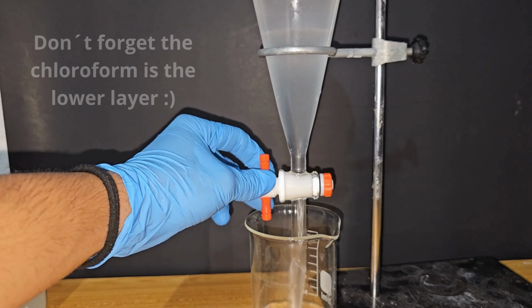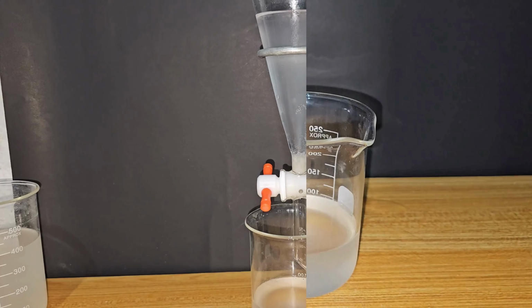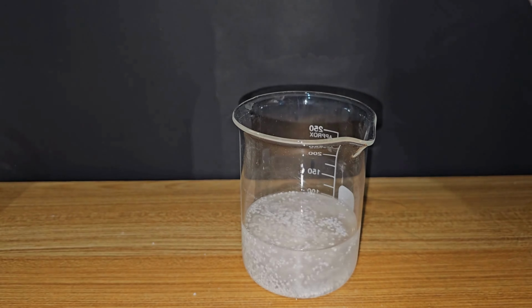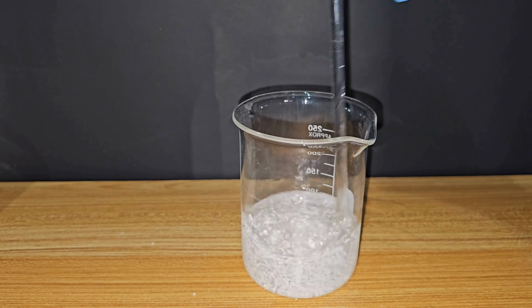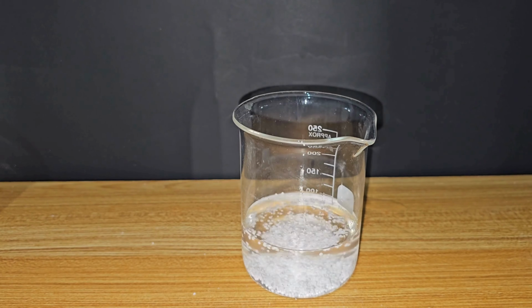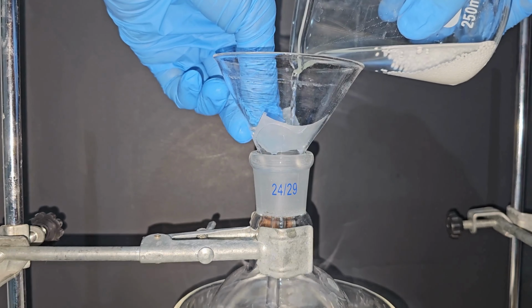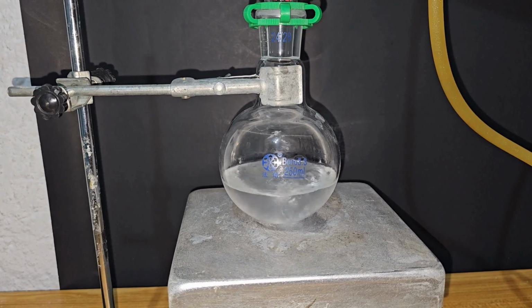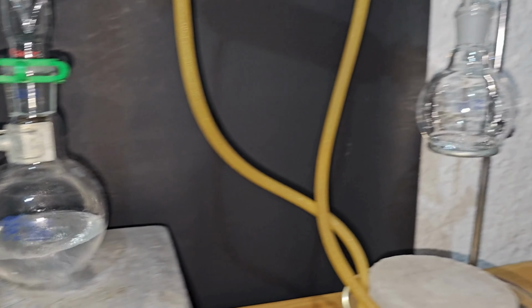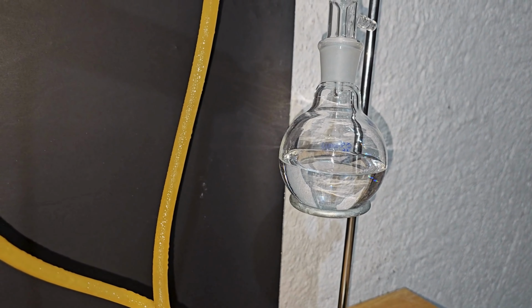50 milliliters in each. I'm only showing you the last one. To the chloroform, I added approximately 5 grams of calcium chloride in order to remove any water left. I filtered the chloroform through some filter paper and set up a fractional distillation apparatus. I discarded the very first 5 ml of the distillation and the last 5.